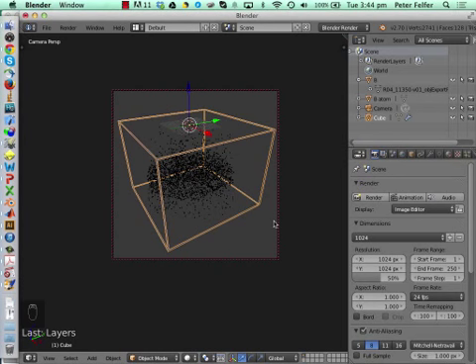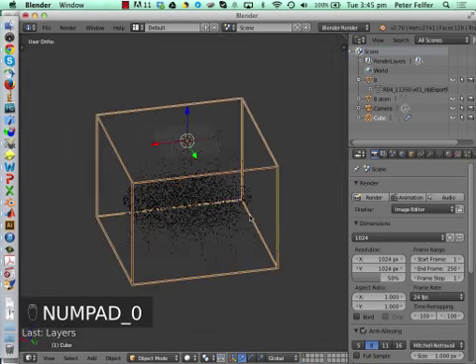You can actually export those into SVG. And that will be a very handy thing for us because then you'll just render every atom as a blob and you can export everything as an SVG, which gives you a lot of options in terms of editing and getting rid of certain aspects of it and so forth. So yeah, that's the visualization.